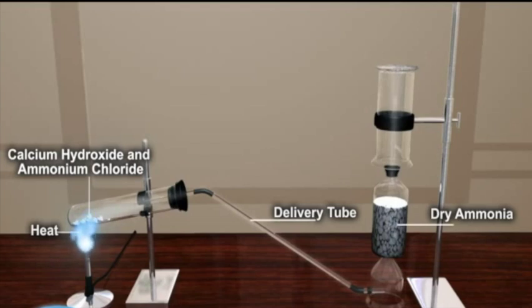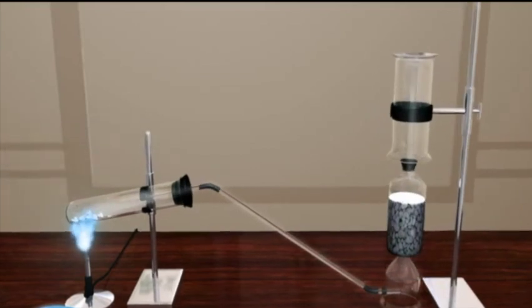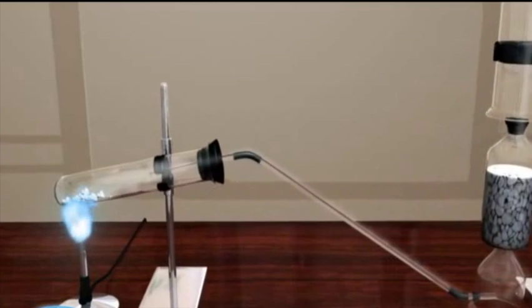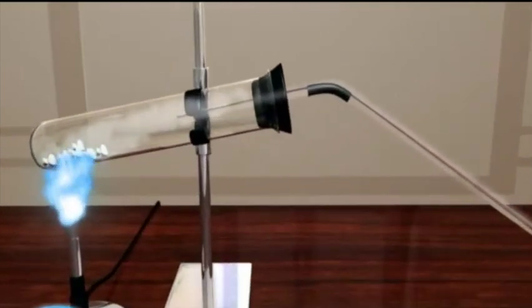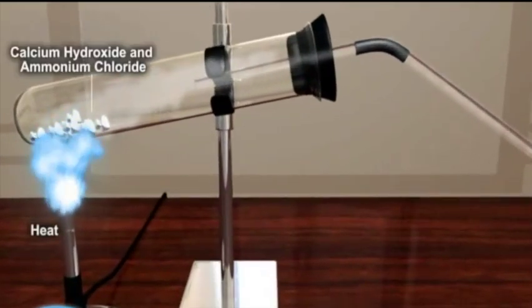Ammonia is prepared by heating the mixture of calcium hydroxide and ammonium chloride. The tube in which ammonia is generated is fixed in a slanting position to prevent the water formed from running back and cracking the whole tube.